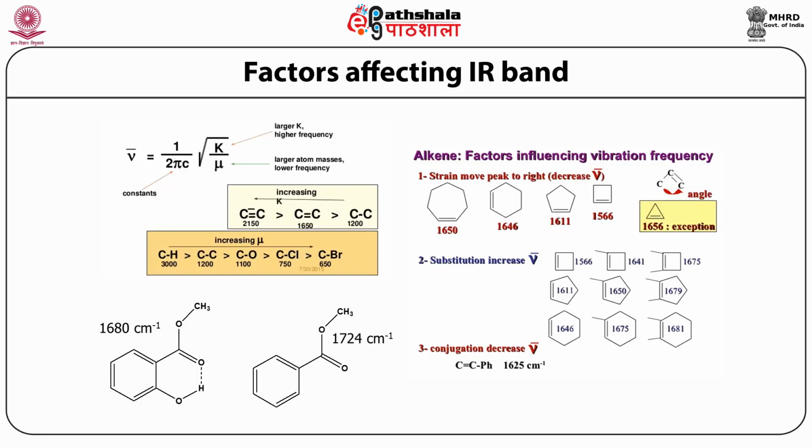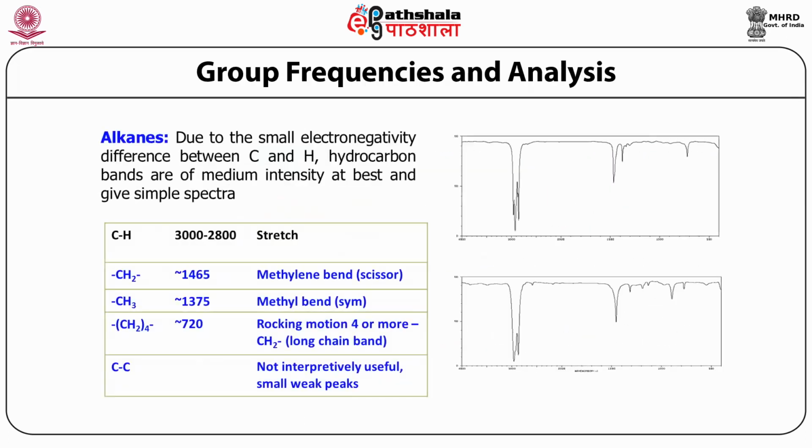As we increase the substitution, frequency increases. You can see this in many examples. And conjugation decreases the frequency. As we increase the conjugation, a decrease in frequency is observed. Here we discuss the group frequencies and their analysis.